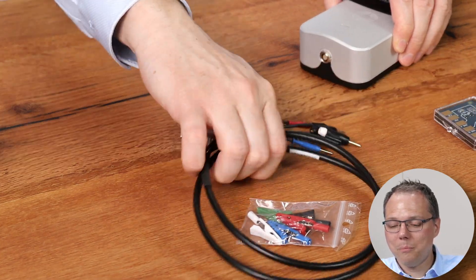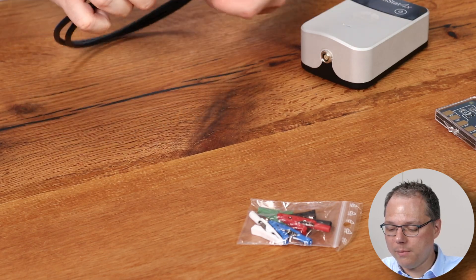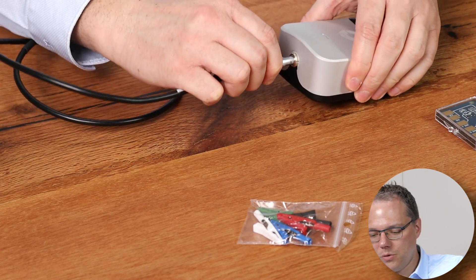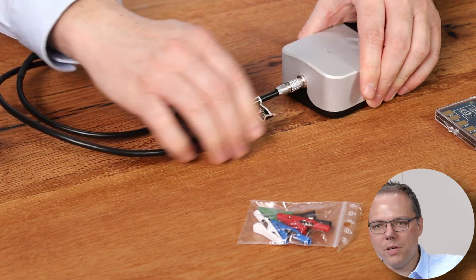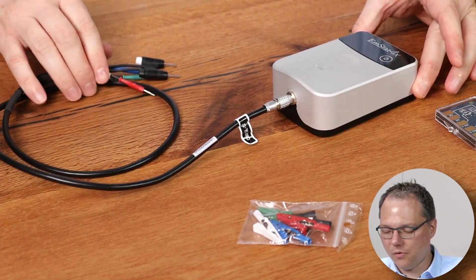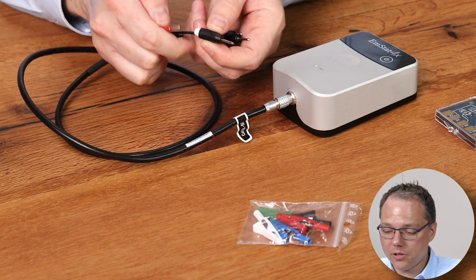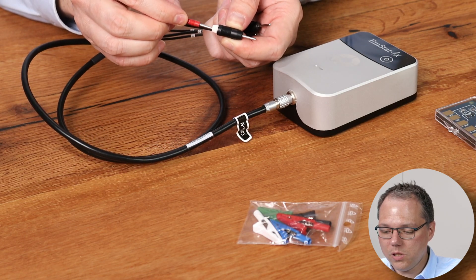I have already installed PS Trace and opened it. I'm also removing the USB cable because we're going to connect our EmStat 4X via Bluetooth. So first let's start by connecting our cable. Look on your plug for the red dot — that one has to point upwards when you connect it to your EmStat 4X.